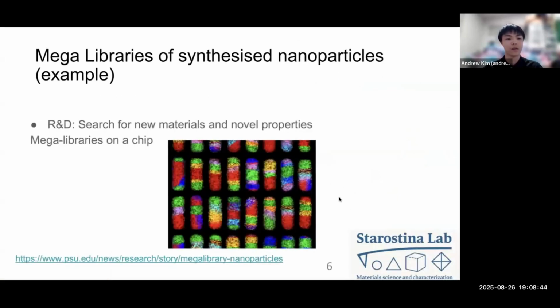There is a lot of interest in the world of nanoscience in making nanoparticles that combine several different materials: semiconductors, catalysts, magnets, electronic materials. Here's an example of a paper describing the research by a team of Penn State scientists. The team starts with simple nanorods composed of copper and sulfur. They then sequentially replace some of the copper with other metals using a process called cation exchange.